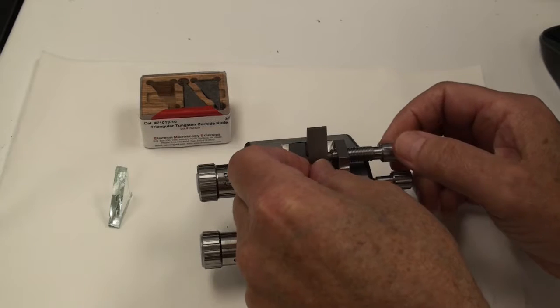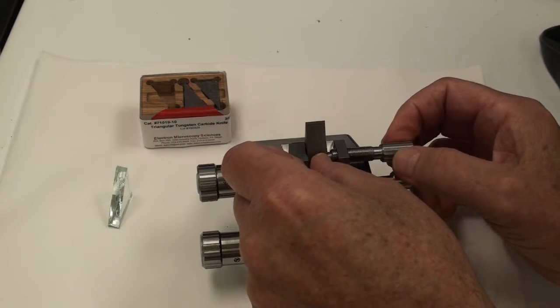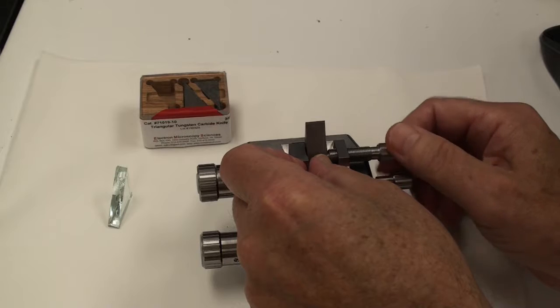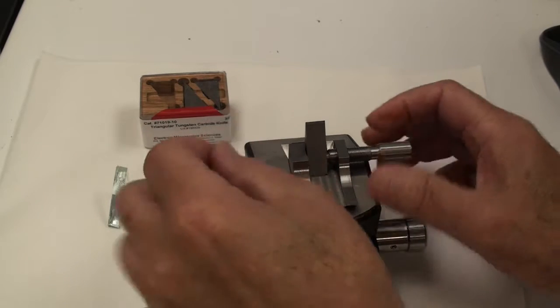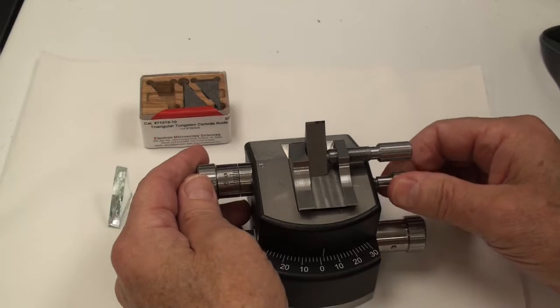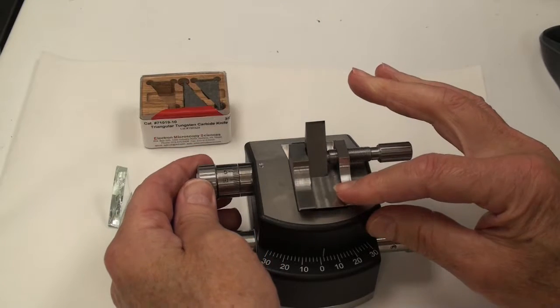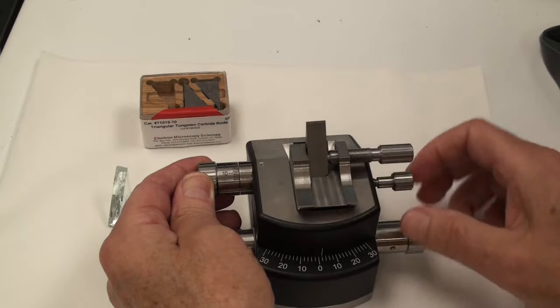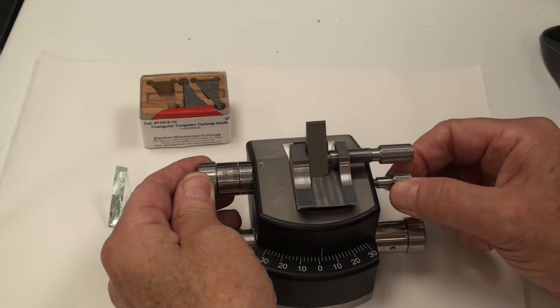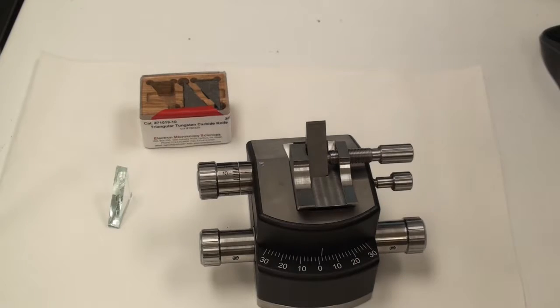So this loads just like a regular glass or diamond knife. We're going to put it in there. This knife does ask for a 10-degree clearance angle. So we're going to set that, and that's a little bit higher. Just remember to reset your clearance angle back when you put in a diamond knife for thin sectioning or a glass knife. So now that's ready. Let's take a look at our facing it off.